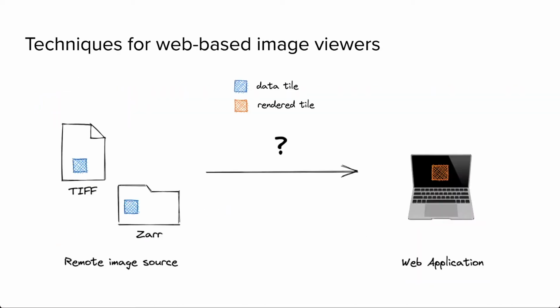Before I talk about Viv, I first want to put the work into context by describing at a high level what needs to occur to render multiplexed and multiscale imaging data on the web. Primary data produced by multiplexed imaging methods are typically represented as multidimensional image stacks, where each channel is typically some sort of chemical signal. These data can be stored in the image format shown here on the left. It's important to note that these files may contain tens or hundreds of different channels depending on the acquisition method. Each of these channels may be captured with 16 or 32-bit precision, and therefore must be pseudocolorized in order for some sort of visualization.